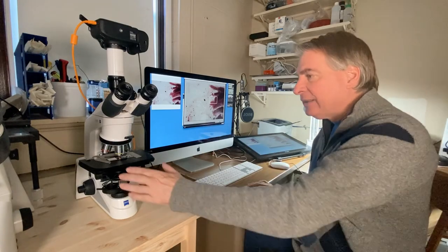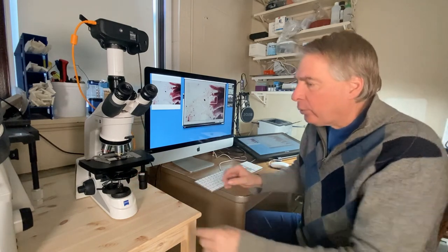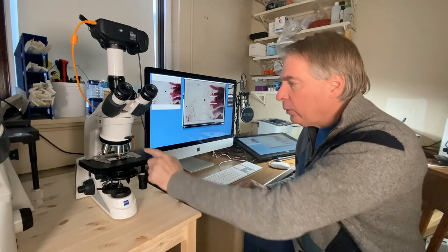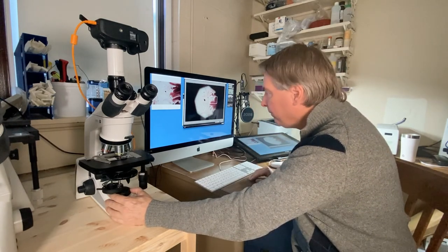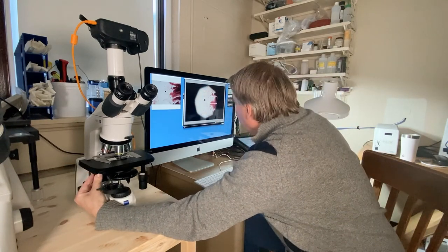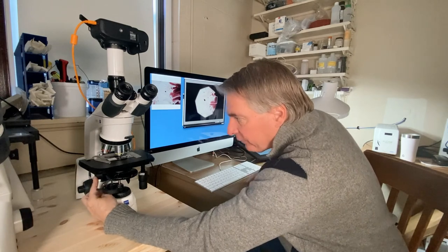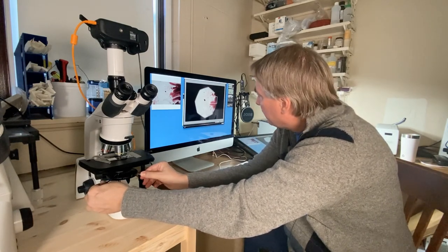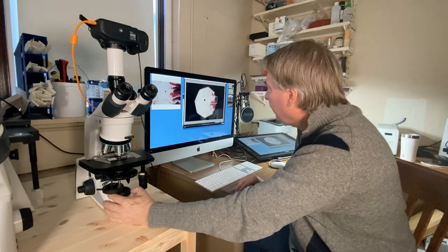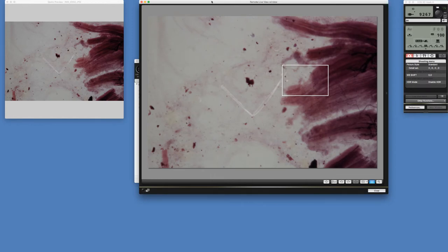The process of aligning the microscope and focusing the condenser so that the light is focused onto the sample is called Köhler illumination, and it's very important to understand what we did. We focused the sample first, then we closed down the field diaphragm — which is an iris — and focused the edges of the field diaphragm with the condenser lens focus knob. Then we centered the light source with the two adjustment knobs. Once everything was set, we reopened the field diaphragm so that the light is even and illuminates the entire view. So that's Köhler illumination.